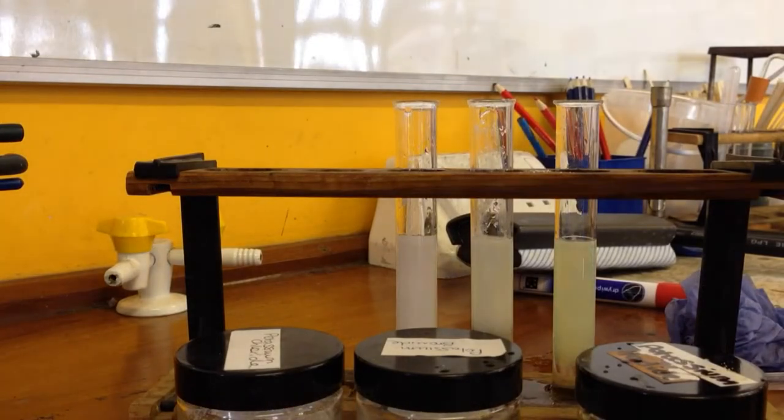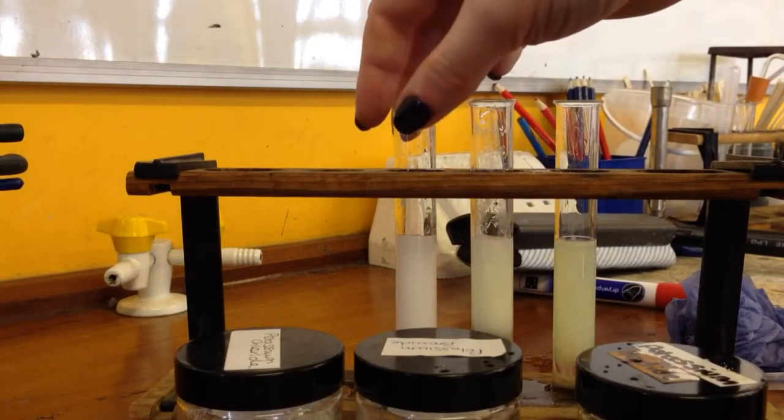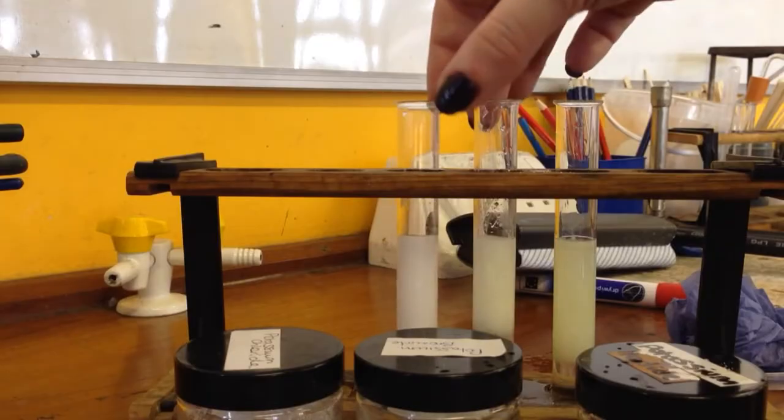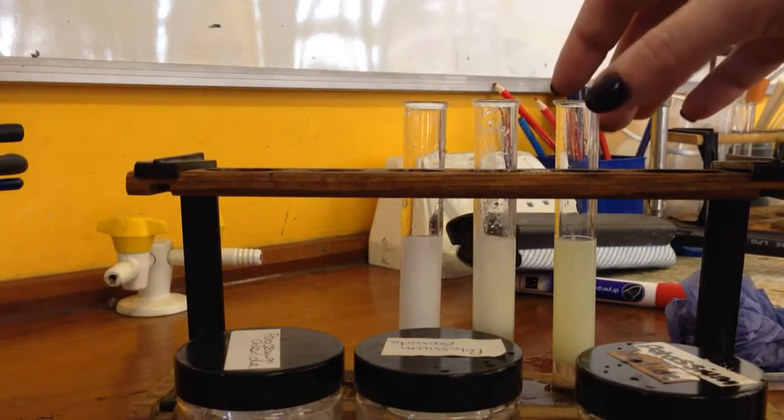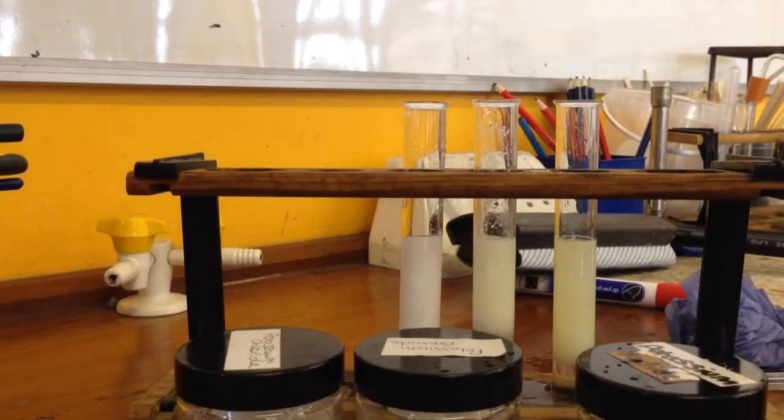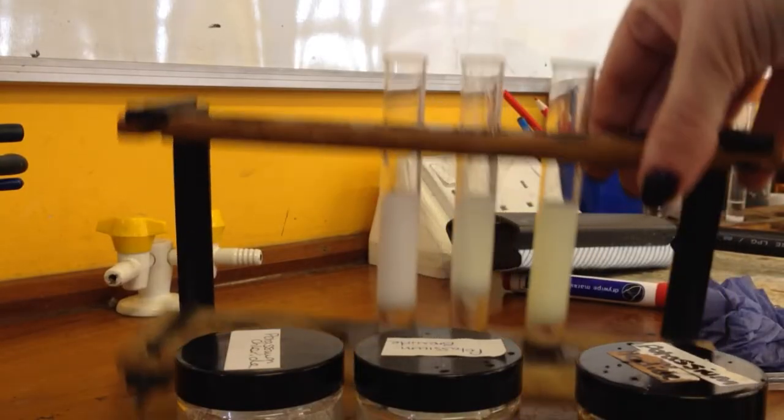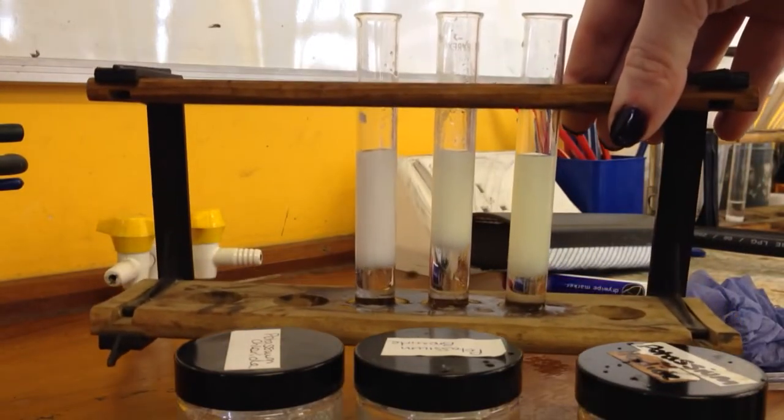We can see they're all forming quite different colors. The chloride solution goes white, the bromide solution goes cream and then the iodide solution goes yellow. So those are the three tests for the halides.